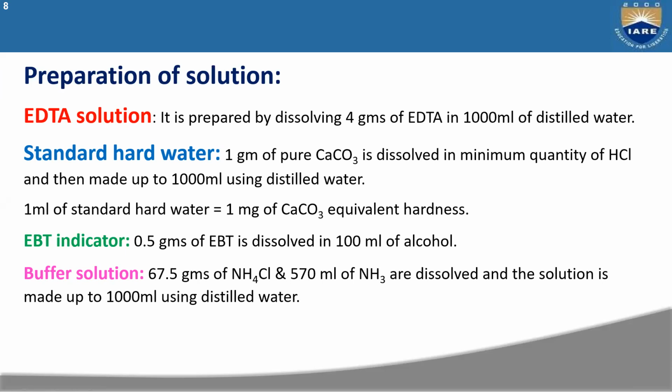So 1 ml of standard hard water is equal to 1 milligram of calcium carbonate equivalent hardness.